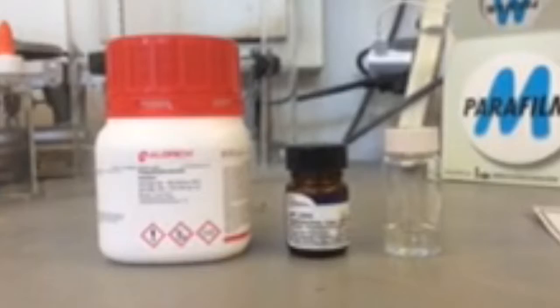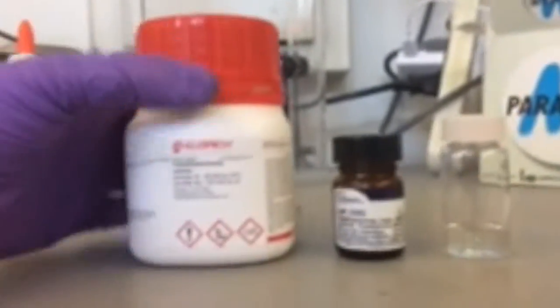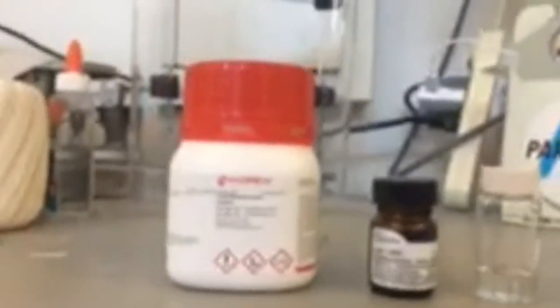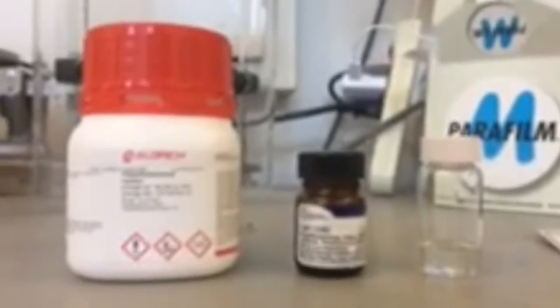Since our future plan is to layer the electrode with polyethylenimine, we began experimenting with the PEI. Here we have branched PEI and linear PEI. We created a stock solution of 2% linear PEI.